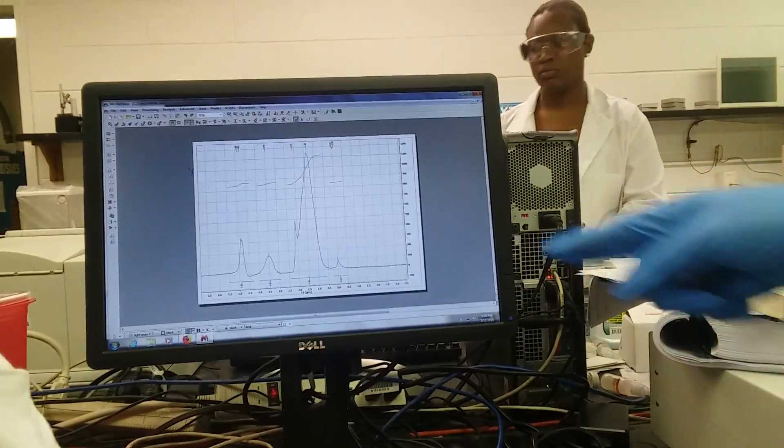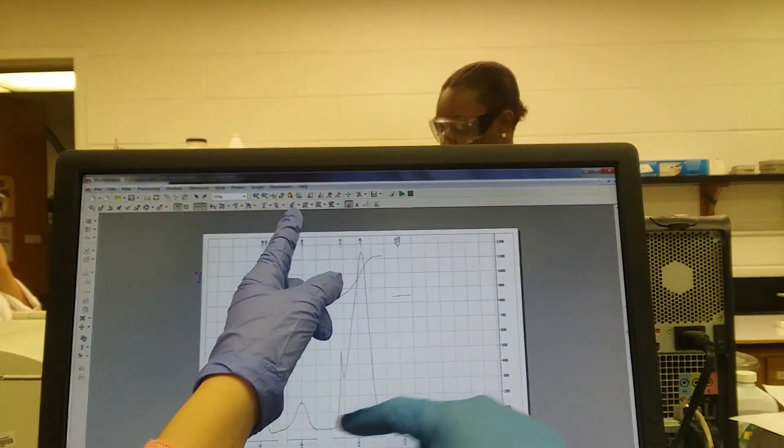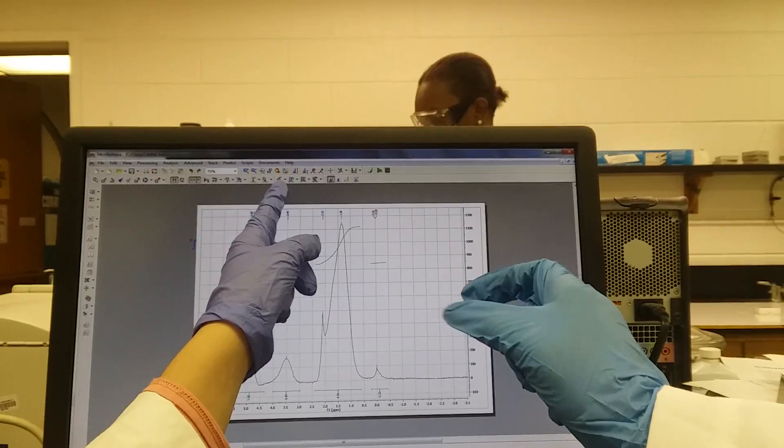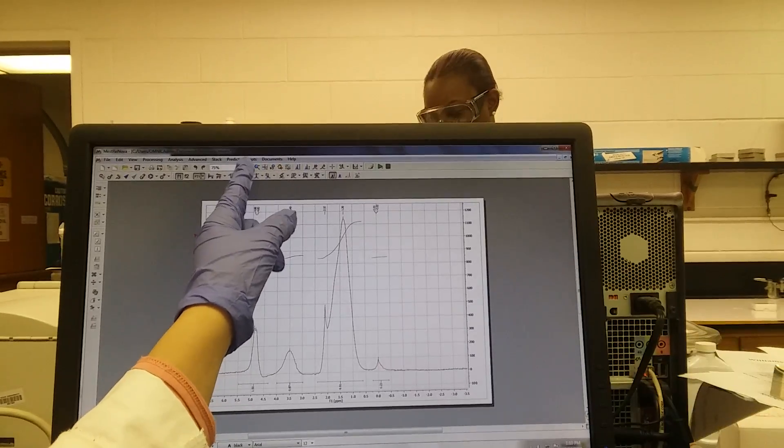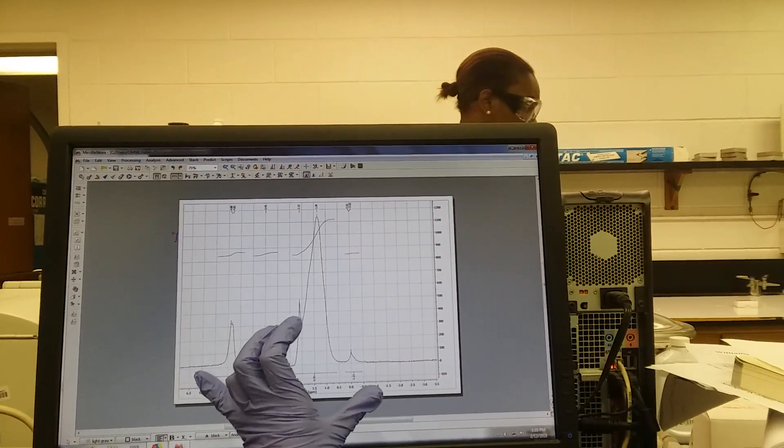The first one we press is this one to zoom in. You have to click here to zoom in on your peaks.